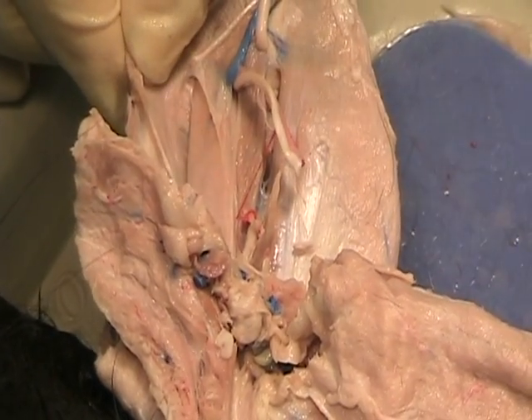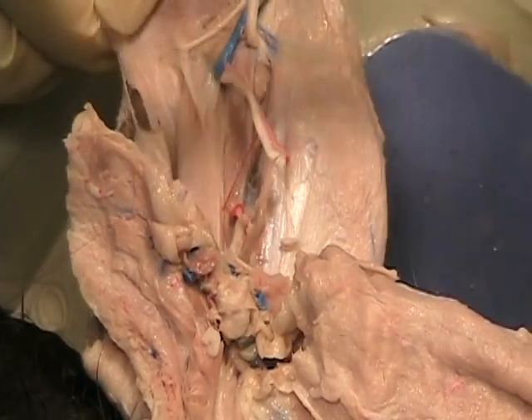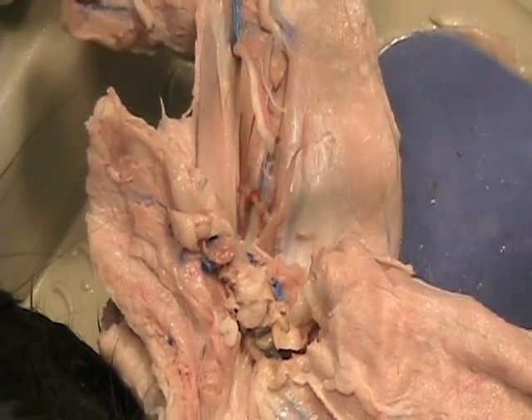So what I'm going to do is make one more little incision here. Still clavobrachialis — actually I'm cutting through pec. Oh, pec.